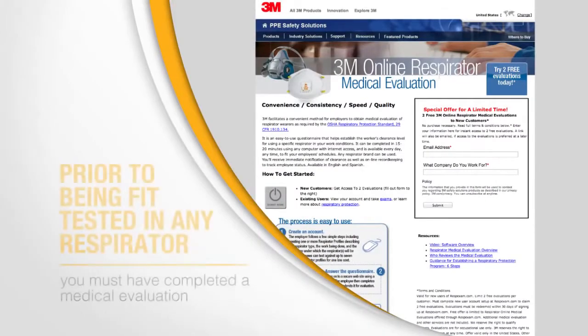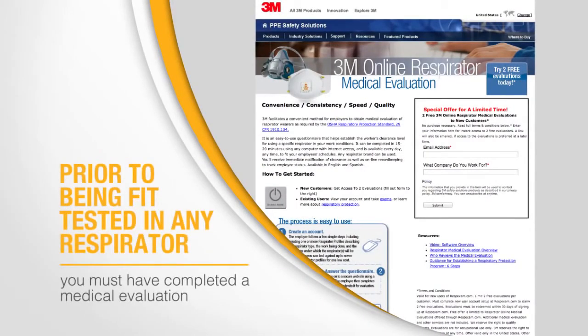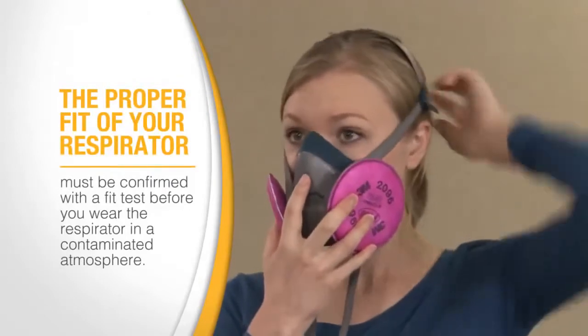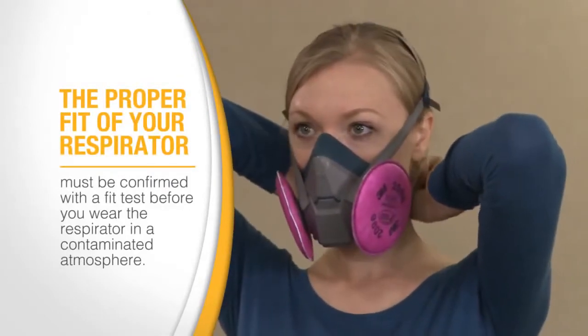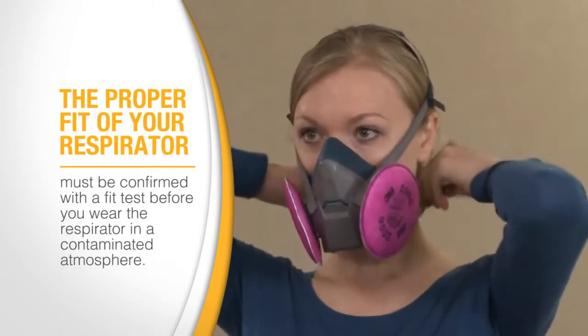Prior to being fit tested in any respirator, you must have completed a medical evaluation, which determines your fitness for wearing a respirator. The proper fit of your respirator must be confirmed with the fit test before you wear the respirator in a contaminated atmosphere. This must be done for all tight-fitting face pieces.